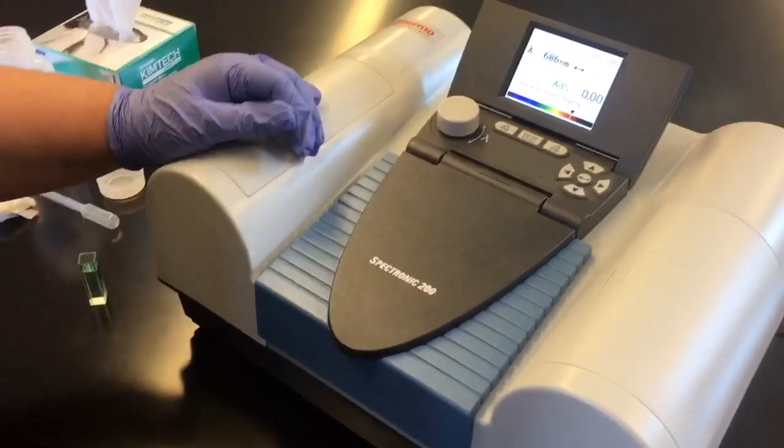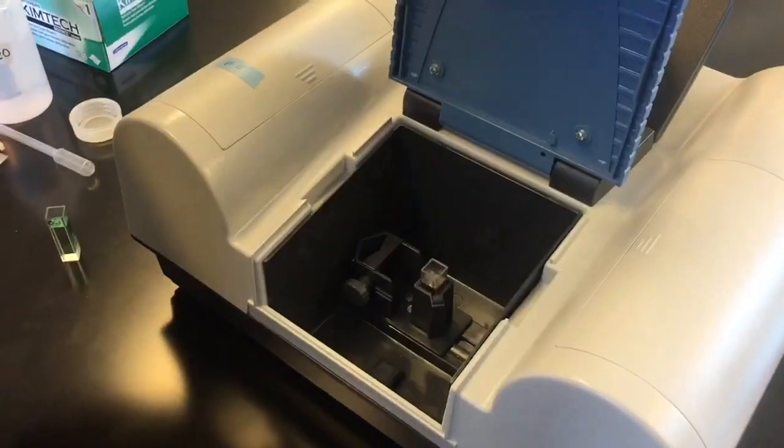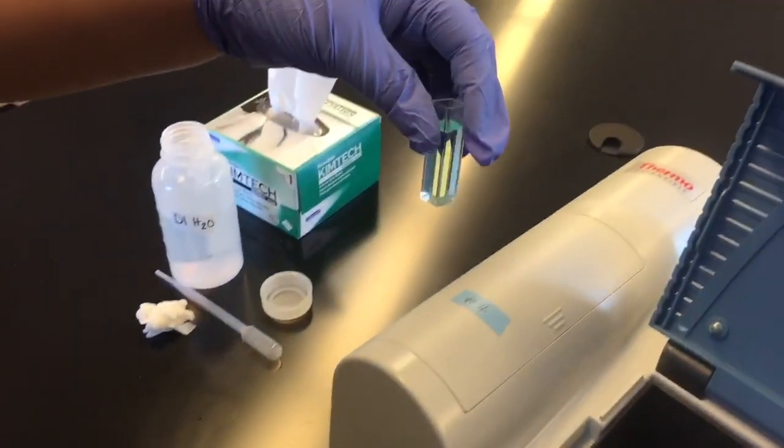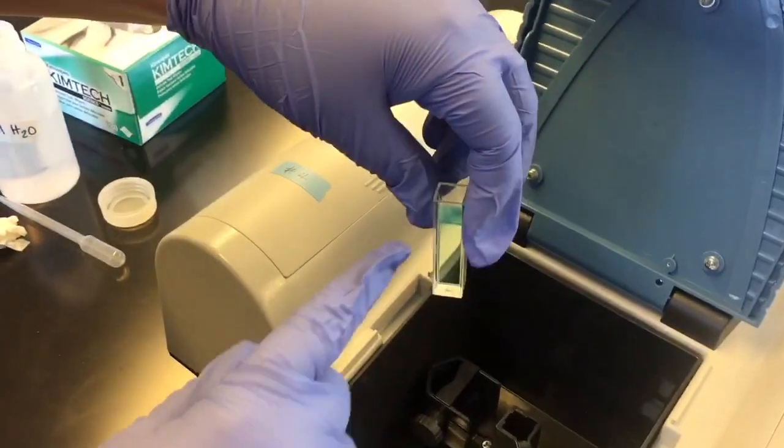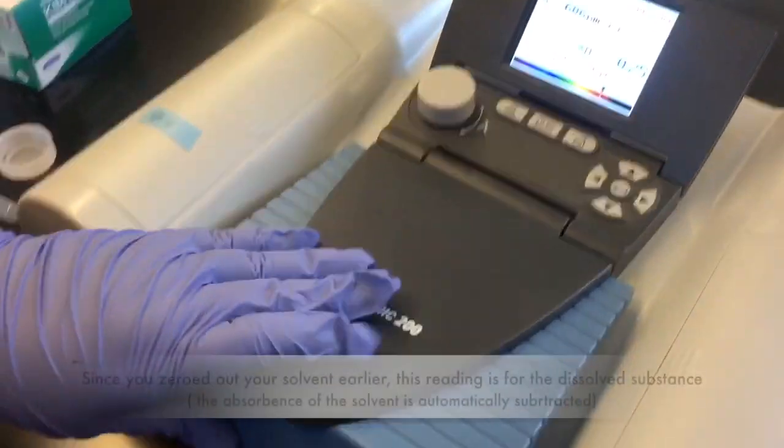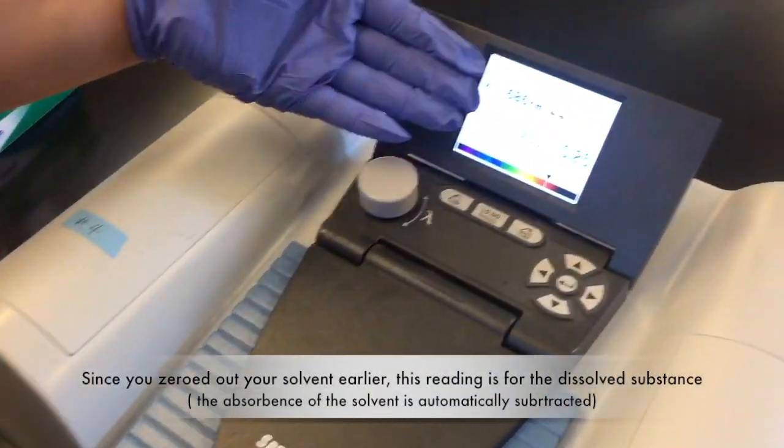Now that you have zeroed out your spectrometer, you're going to open the lid once more and take out your DI water. You're going to take the sample cuvette that you have filled up to the line below the arrow, put it in, and close the lid. Then you're going to get your result.